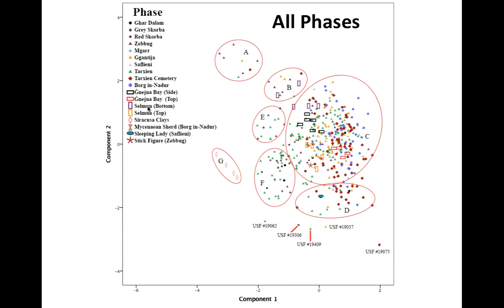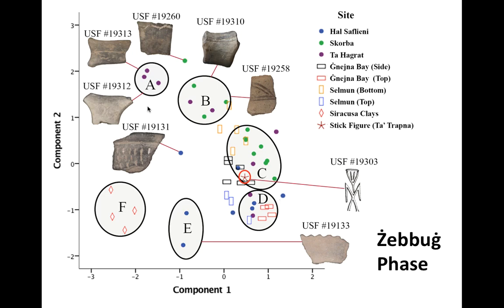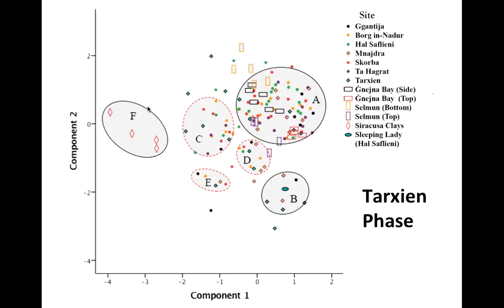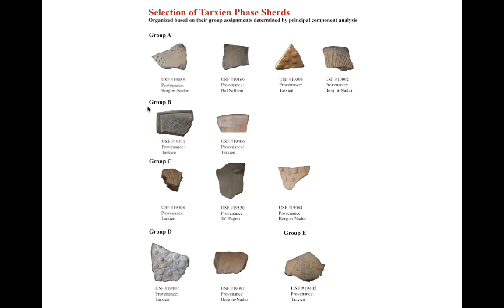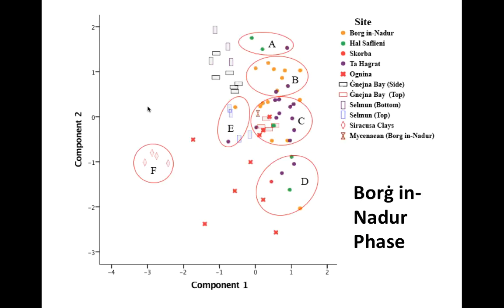This is basically all the shards and geological clays that were tested. And you can see the general patterns that were formed by the statistical analysis. I then analyzed the data for each of the chronological periods: the Neolithic, the Zebbug phase of the Temple period, the Ggantija phase, the Tarxien phase, and this is the graph for the Tarxien Cemetery phase shards that were analyzed, and the Borg in-Nadur phase shards that were analyzed for the Middle Bronze Age.